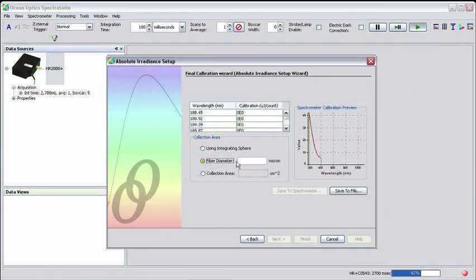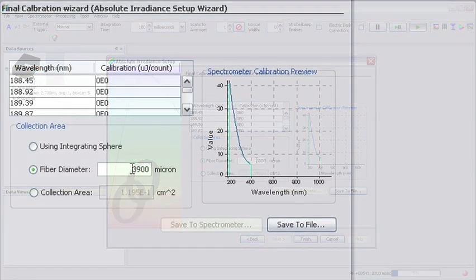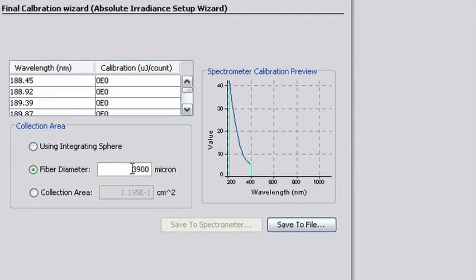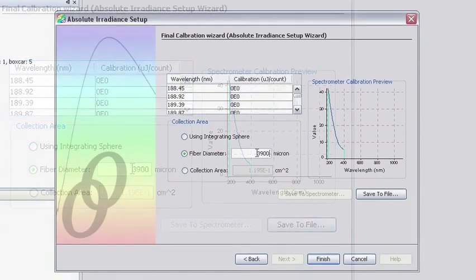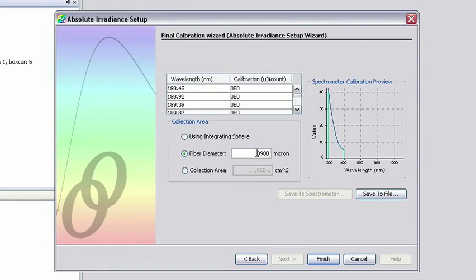In this screen, we'll need to input our fiber diameter or collection area. Since we're using a CC3 UV-Cosine corrector, we'll input 3900 microns in the fiber diameter under collection area. The spectrometer calibration preview graph should show two lines of different colors, nearly one on top of the other. This indicates that the calibration file and the measurement of the lamp are in agreement.